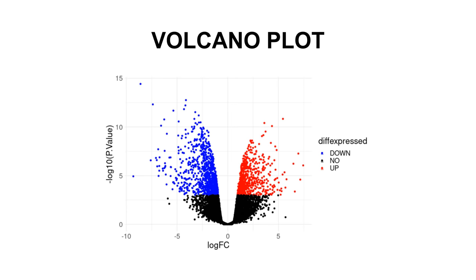In today's video, I am going to show you how you can use R to generate volcano plots when dealing with gene expression data. Volcano plots are two-dimensional scatter plots that have the shape of a volcano. There are log fold changes on the X axis and on the Y axis we have the negative log of the P values. By setting a threshold, you'll be able to identify genes that have been expressed significantly.